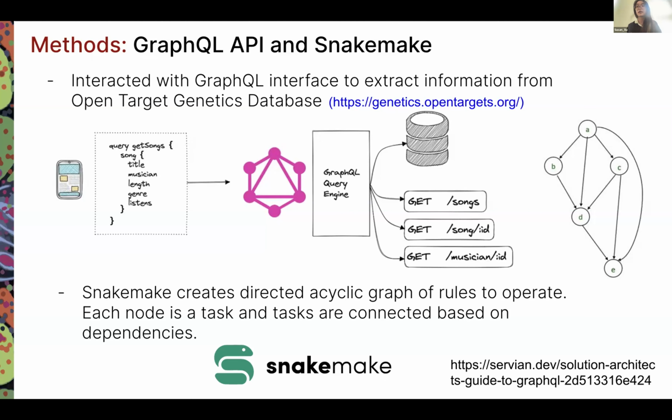To streamline our bioinformatics pipeline, I use Snakemake, which is a widely recognized Python-based tool for bioinformatics pipelines, which employs user-friendly rule definition to run scripts and manage dependencies seamlessly.